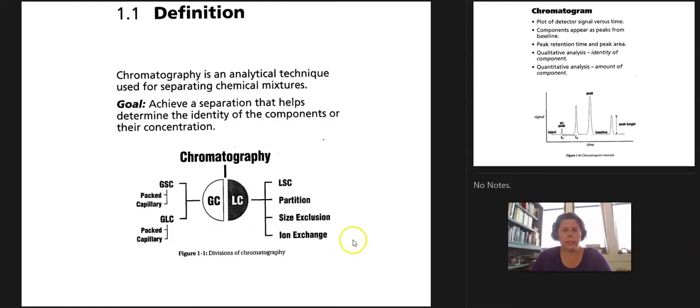So what is a GC? All of these things are referred to as chromatography. In analytical chemistry, there are people who study this. This is their main area of research: how do we separate compounds? How do we separate things that are maybe even too close to each other? Remember I mentioned the xylenes, the O, P, and M. Well, what happens when you've got tons of them in there? Or how do you separate things that are very close to each other? Or are there faster ways, better ways, increased detection out there?